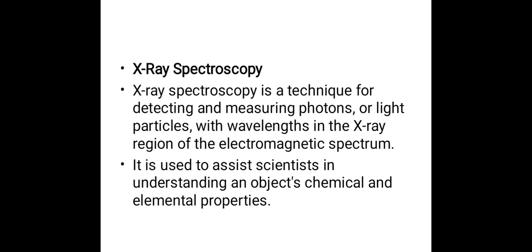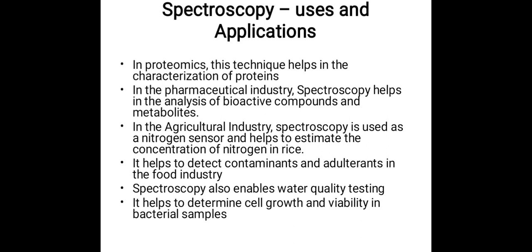Sample is there, electron beam is hitting that, X-ray signals are there, detector, amplifier, computer, display, data output device. First we will be hitting the electron beam onto the sample. Later, X-ray signals are produced: detector, amplifier, computer, display, and data output device.